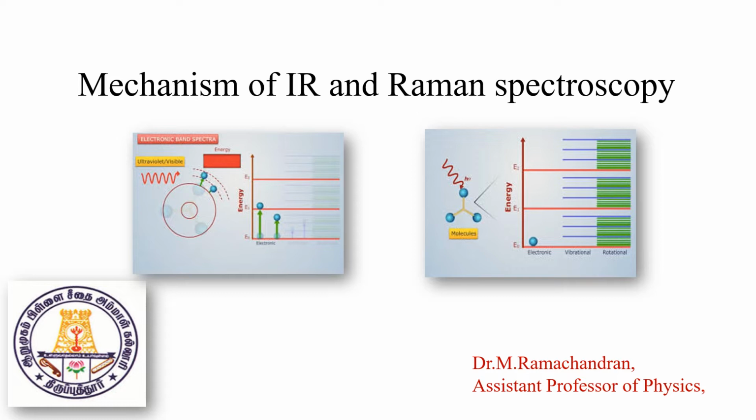So this second diagram shows that there is one type of electromagnetic ray that is possible to vibrate the triatomic molecule. During the triatomic molecular vibrations, there are three types of transition. One is electronic transition, and rotation energy and also vibration energy are possible. Vibration energy gives one single line spectra, but for rotation energy you have the fine structural line spectra.